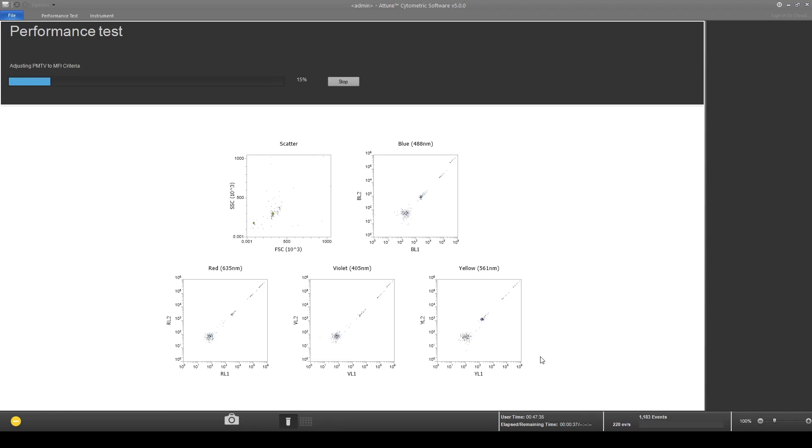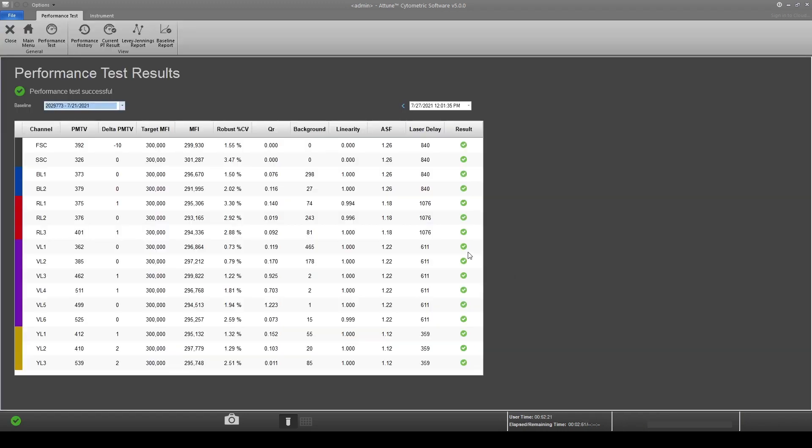The interface will show scatter plots confirming the lasers and detectors are functioning. You can follow the performance test progress. When the performance test is complete, a menu will come up showing the test results. Confirm the performance test has passed before proceeding.